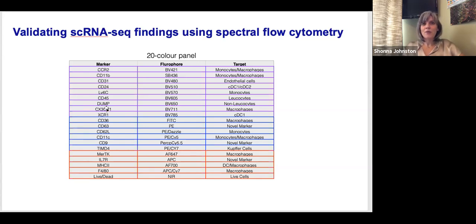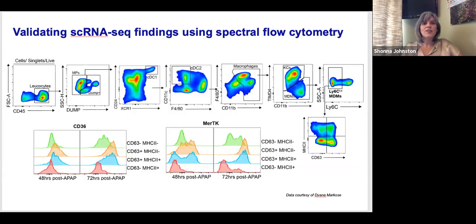So one of the things I am going to mention in case anybody notices is she did use BV650 as our dump, but our antibodies were biotinylated and she was coming in with a streptavidin 650. So there shouldn't have been too many differences in that tandem dye that she was using there. And then she was able to look at this sort of setup in here.